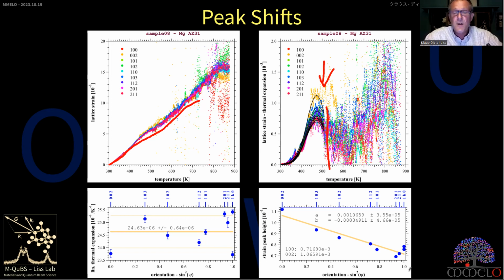It is anisotropic, a strain ellipsoid, because they fit a straight line. That means in the z direction, 0 0 0 2, we have a larger expansion due to that bump than in the a direction or ab plane, which is similar by symmetry. In between, we get values in between.